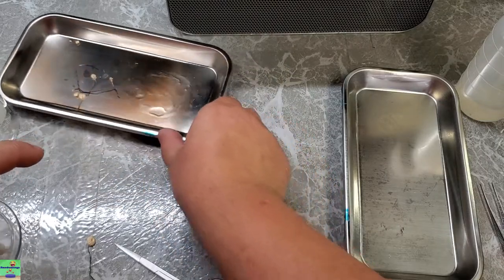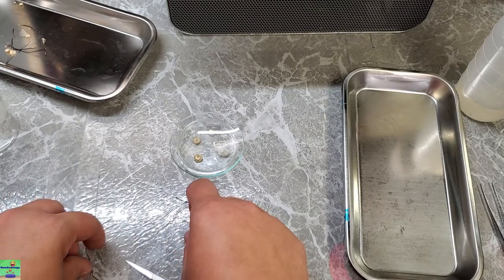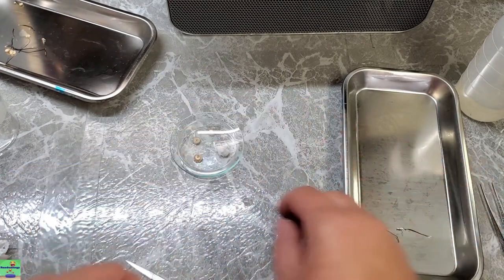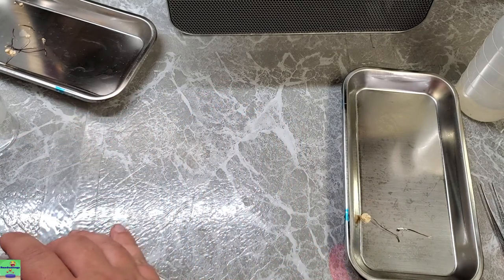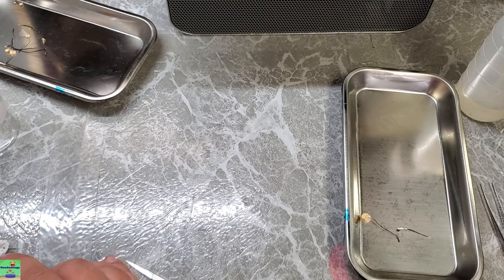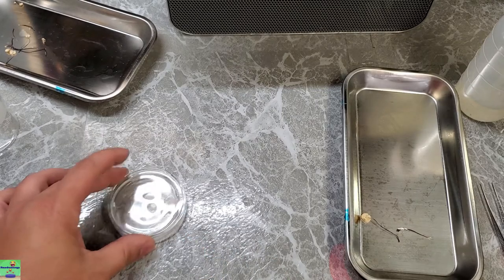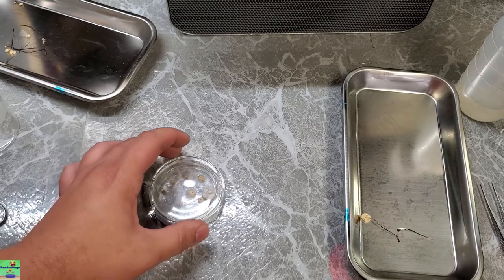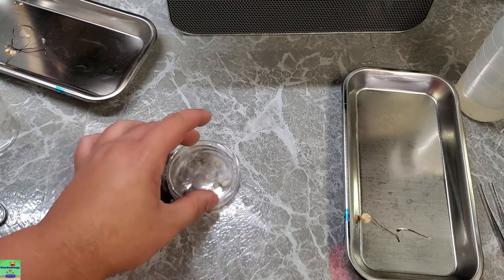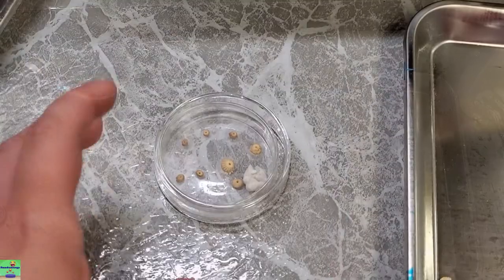This is just something that I put together because, you know, this is my hobby, and this is what I like to do. So yeah, then you just put these off to the side, and room temperature's fine. You don't want it to get too hot because then your mushrooms might start deteriorating. Give it about maybe a day. And this is a sample that I prepared a day ago, and we'll get into this in the next part of this video. So let's do that. All right.